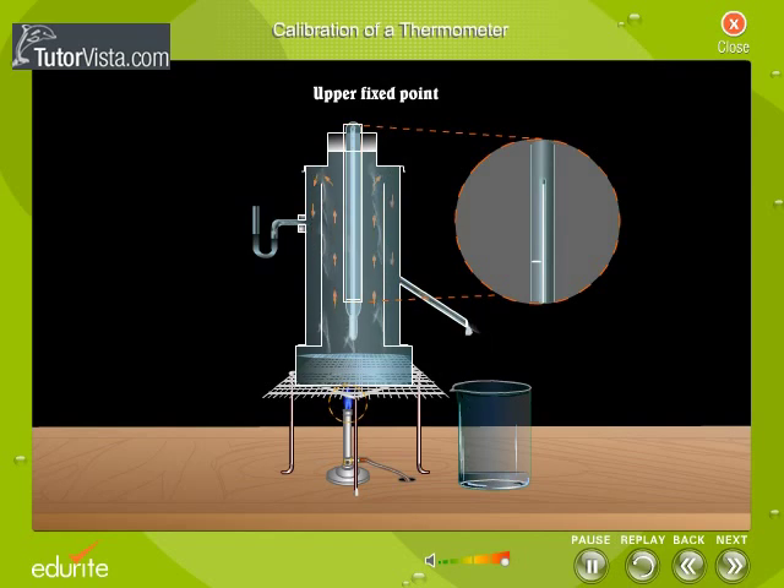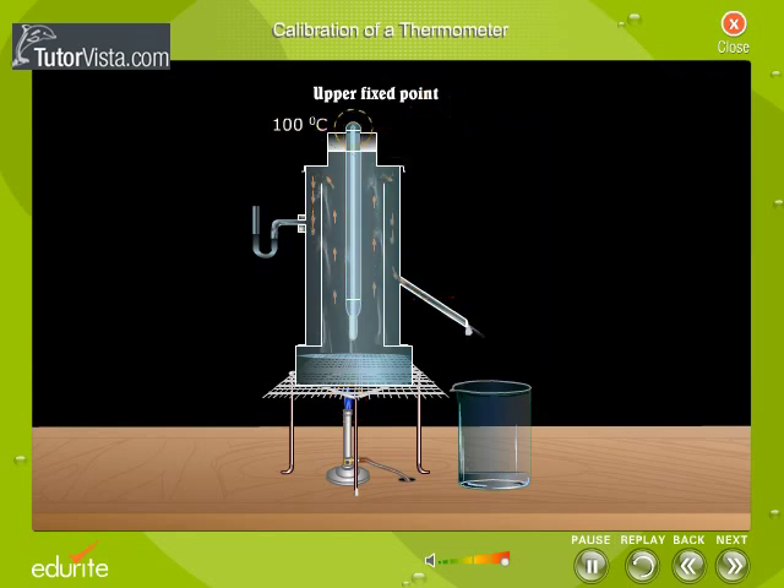When the mercury meniscus in the thermometer remains stationary for a sufficiently long time, a sharp cut is made at that point with the help of a file and that point is marked as 100 degrees Celsius. This is the upper fixed point or the steam point. Care is taken to see that the pressure of steam inside the Hypsometer is the same as the normal atmospheric pressure.